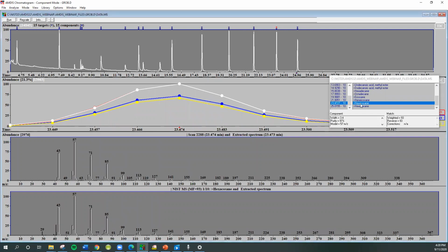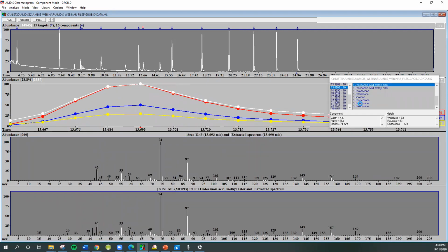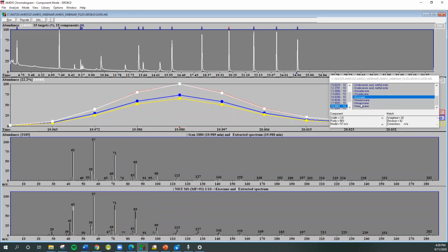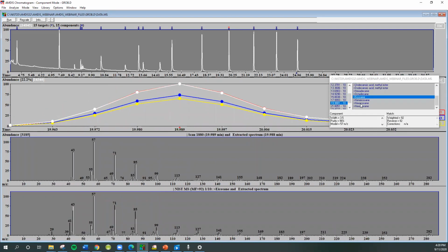You can actually send reports out to customers with just names on it. So if you just got something that's simple, or you want to look at a complex mixture really quickly and see what might be in it, I find it very useful to do that. It's actually working in both directions now. Sometimes it gets hung up, it's a bug. All right, so that's good. So we've found a way to identify everything.